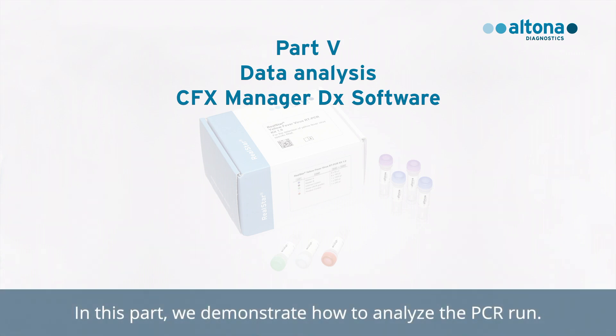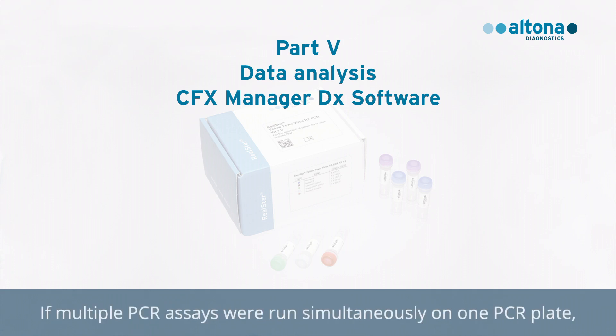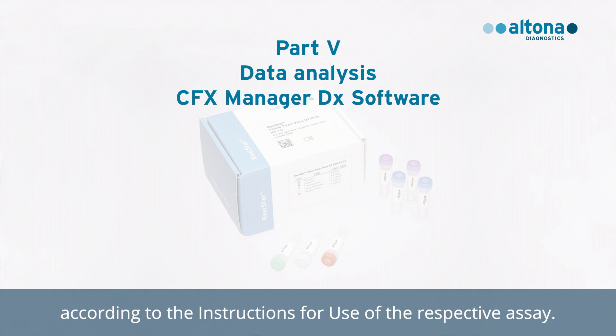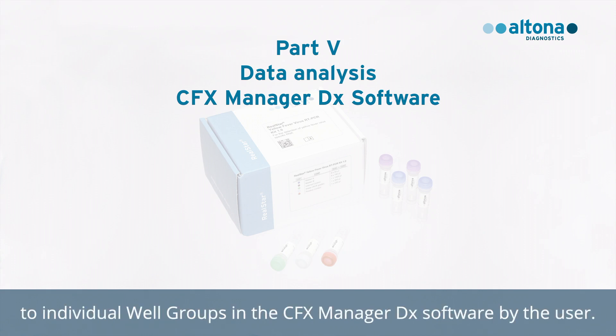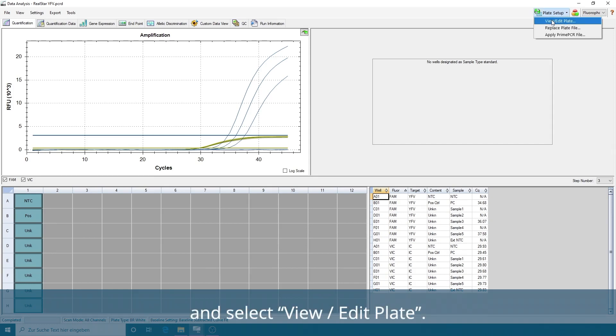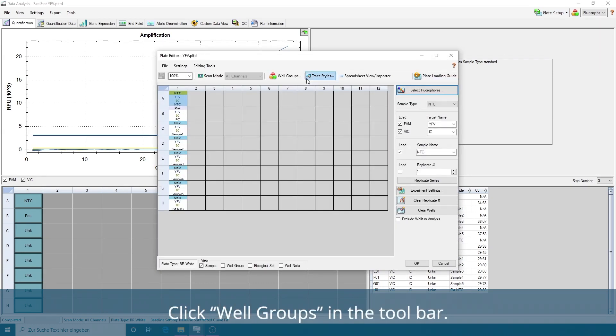In this part, we demonstrate how to analyze the PCR run. Once the run is finished, you can analyze the results. If multiple PCR assays were run simultaneously on one PCR plate, each assay must be analyzed separately by the user according to the instructions for use of the respective assay. To do this, all assays on a PCR plate must be assigned to individual well groups in the CFX Manager DX software by the user. In the Data Analysis window, click the Plate Setup button in the toolbar and select View / Edit Plate. The Plate Editor dialog box appears.